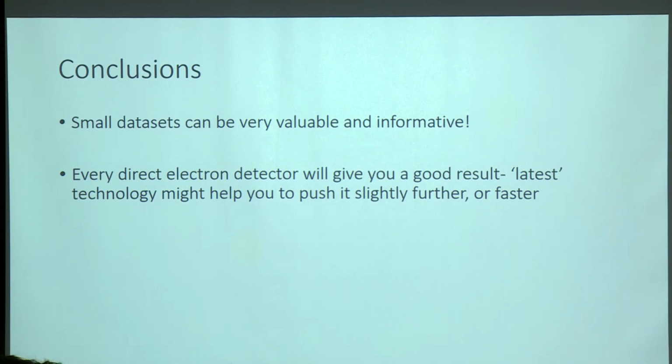Because if you can answer your biological question in 15 minutes, it's much more efficient for you to do that than to collect 24 hours of data, have to move it, use computational resource to process it, and then, depending on your funding agency, you may have to keep that data for 10 years, for example. So I think we really need to think carefully, and working within a cryo-electron microscopy facility at the moment is fascinating, because we need to work out a way of getting the most out of this incredible technology that we now have at our disposal, whilst also ensuring that people who work within facilities can sleep. So yeah, it's really interesting.